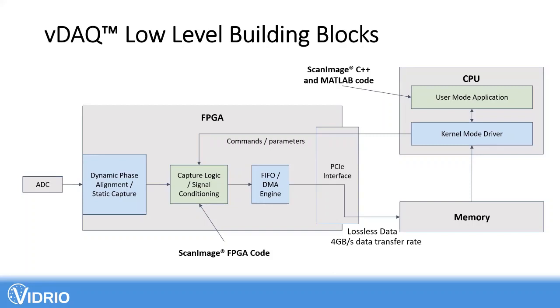So I think, Andrea, that you may have talked to Georg about this in the past, and I think it's a really good idea to try to put in a TCP connection into the C++ layer. I think that would give you what you want. I mean, we were worried before, I think, when we talked, you can access the data from the MATLAB layer, but as John mentioned, it's not lossless, right? Because sometimes MATLAB falls behind, and to make sure that you get lossless data, you've got to get to the C++ layer.